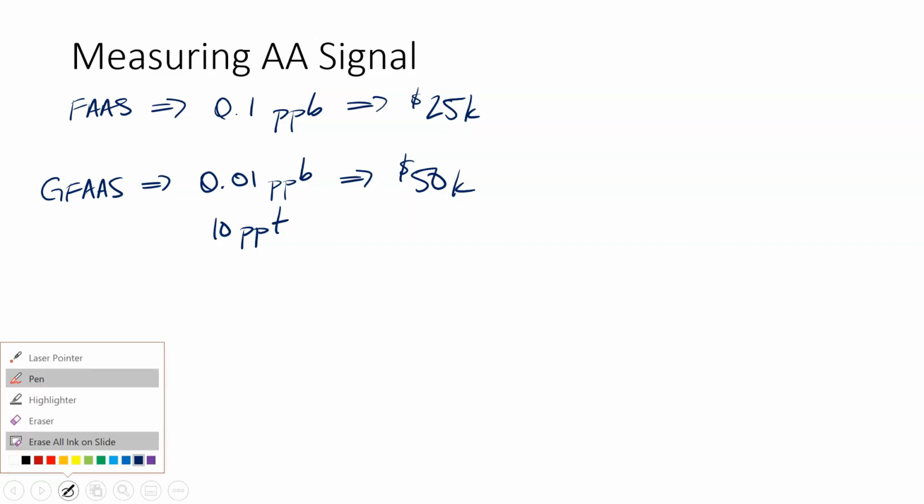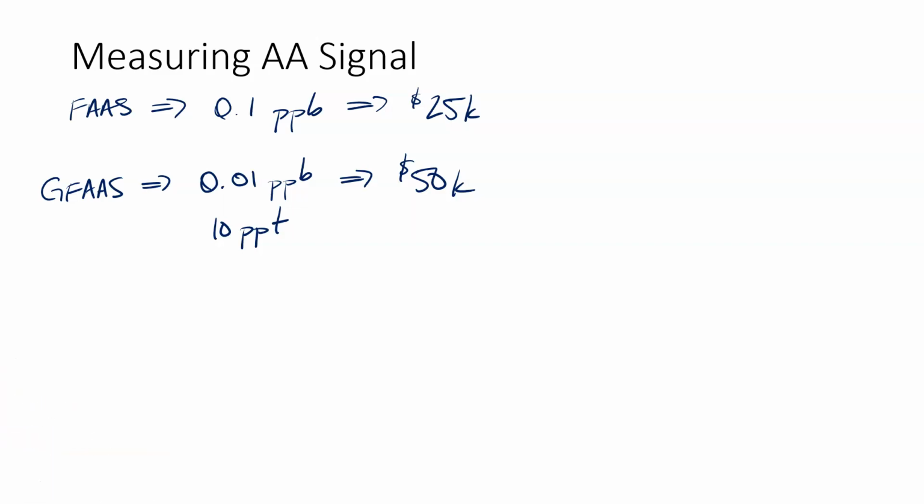One of the drawbacks of the graphite furnace, right, is that if you have very concentrated samples, it's not going to work very well. And so this isn't great above, say, 10 parts per billion. The reason being, we have that sample in that small container, and remember that measurement is so quick because that plume doesn't last forever. That argon sweeps through and clears it out. Because that sample size is so small to begin with, and our measurement time is so short, if we have a whole lot of sample, we're gonna hit that limit of linearity real quick, right? We're gonna get to that nonlinear part of Beer's law with a pretty low concentration, actually.